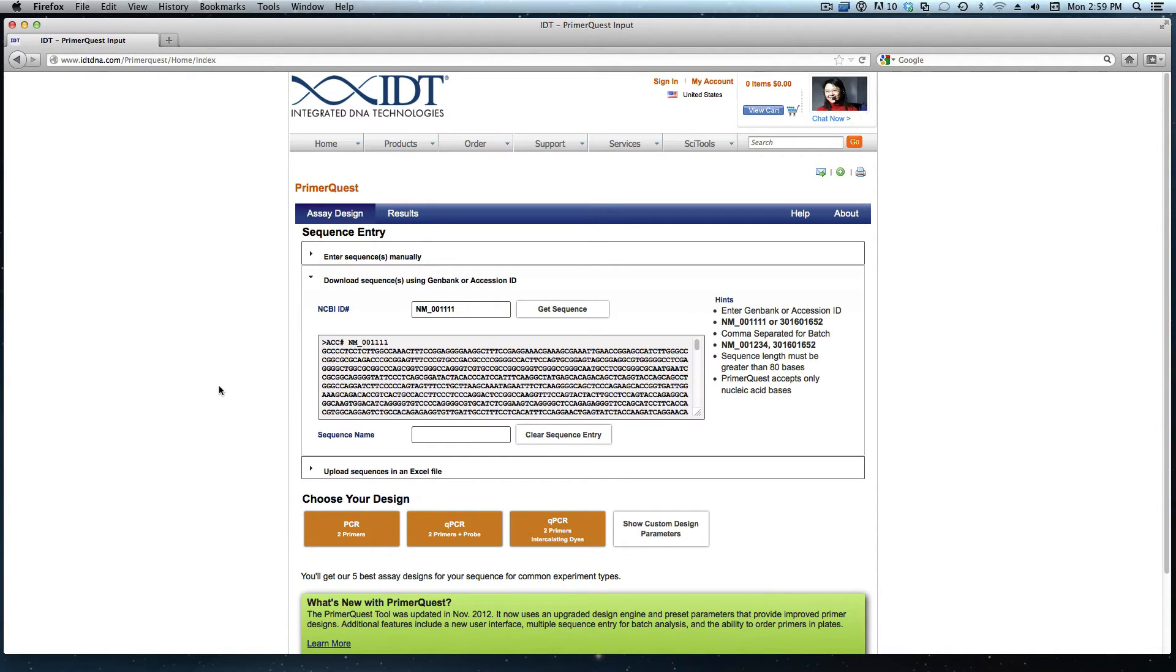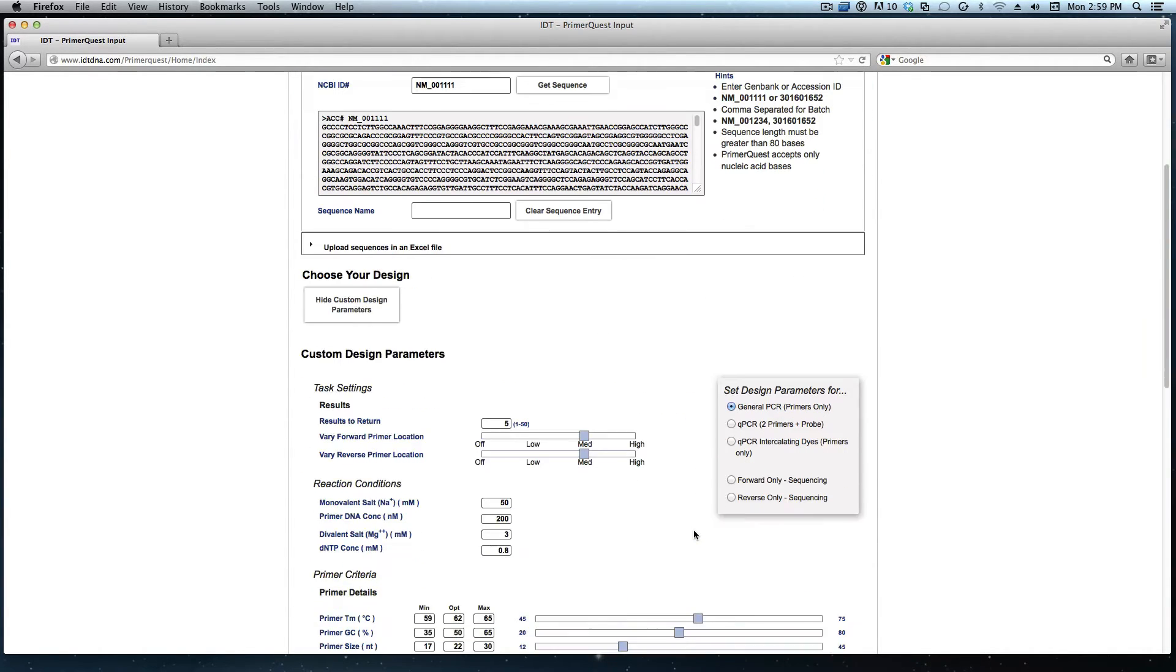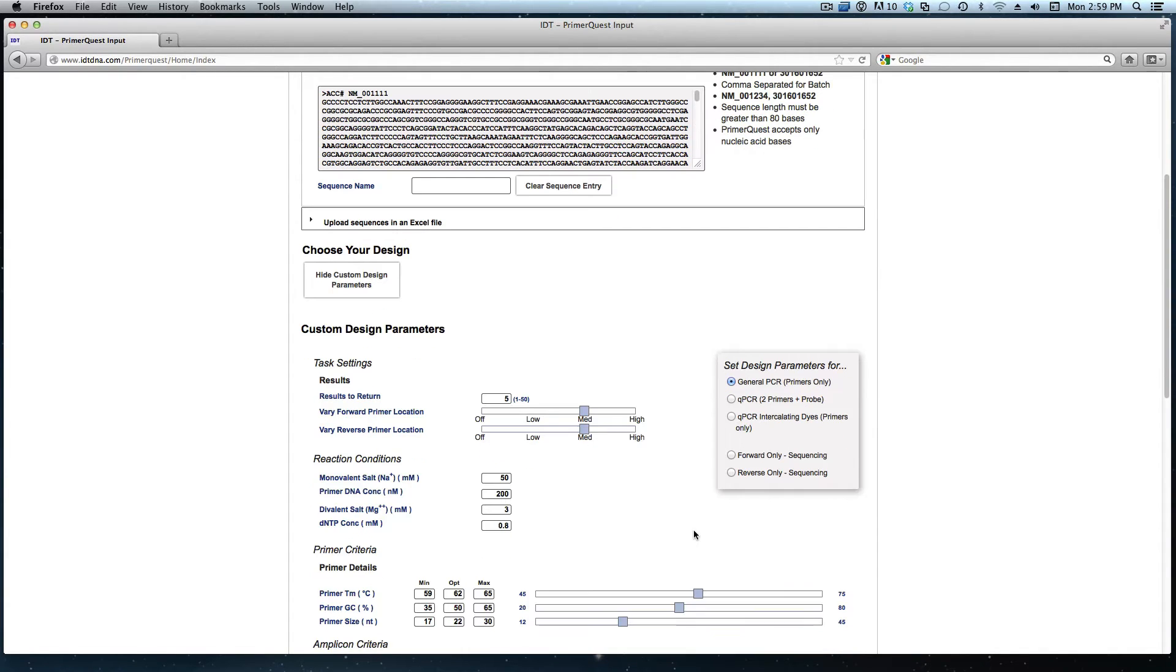As I mentioned I want to design primers to flank a specified region. In this case I should choose show custom design parameters so I can indicate to the tool exactly where I want it to design.